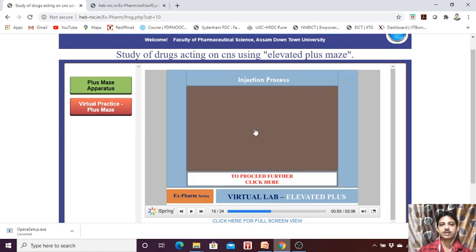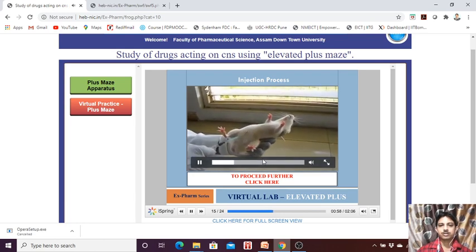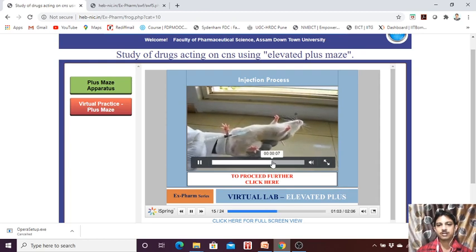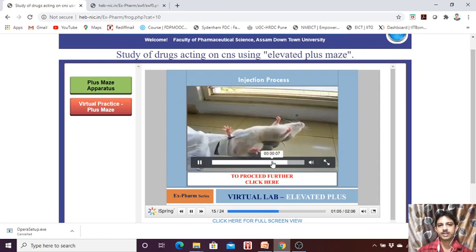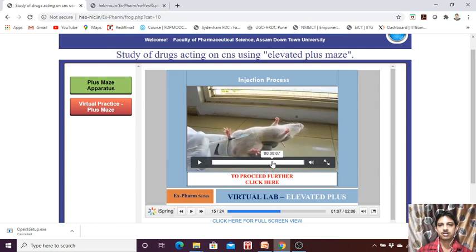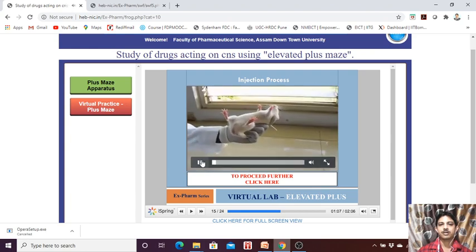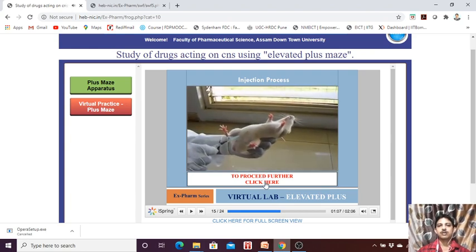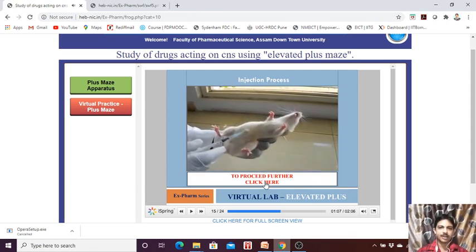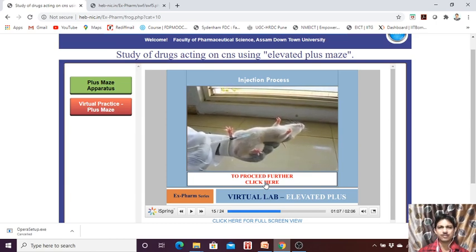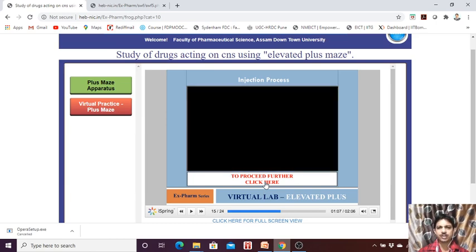In the second part, the drug was injected intraperitoneally into the rat. The drug is given to the experimental animal. Here we can see how the drug is administered to the animal. We are mostly using mice — though it is showing a rat here, we can generally check with mice as well.